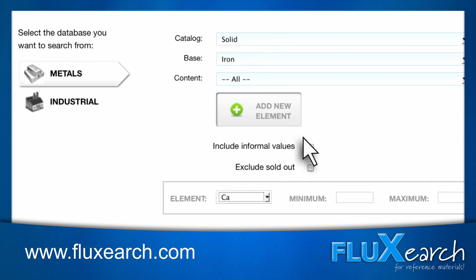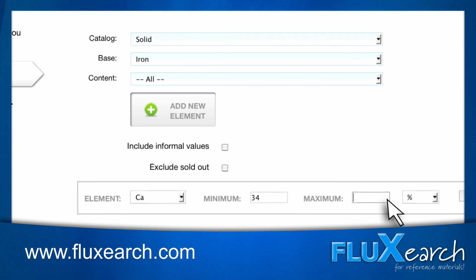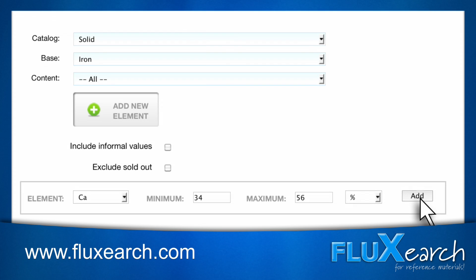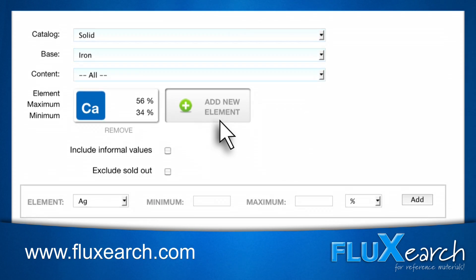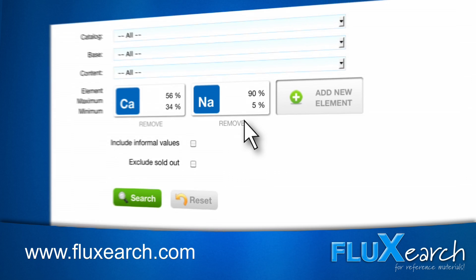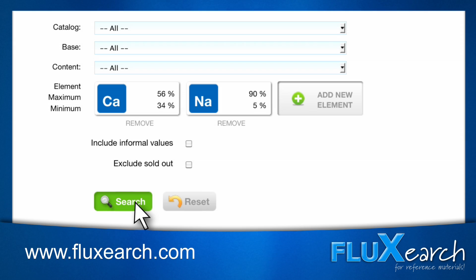Click on Add New Element, select the element you're looking for, enter the minimum and maximum concentration, and click Add. You have the option to add more filters if necessary. You can choose PPM or percent as unit. In this case, two filters were added. When finished, click Search.